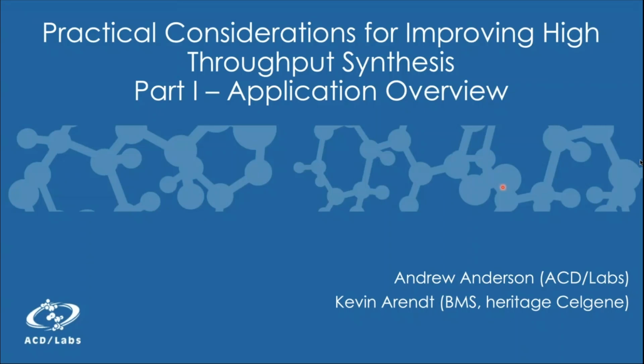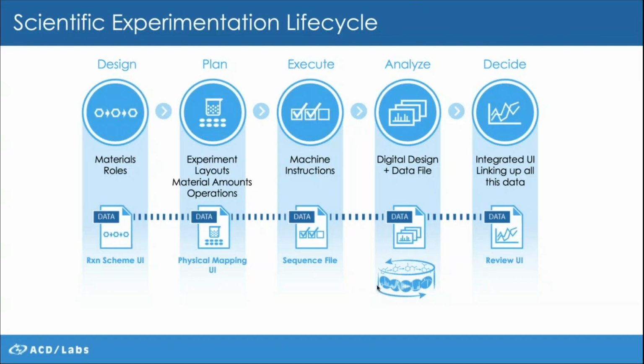One thing that I like to describe in introducing this product is the various unit operations in the traditional scientific experimentation lifecycle, starting with design, where a scientist will envision a particular experiment or parallel experiment to run, defining the materials and the role of those materials in an experiment.